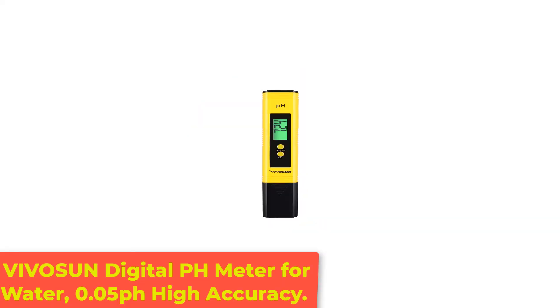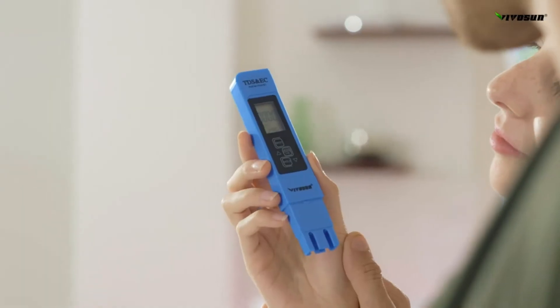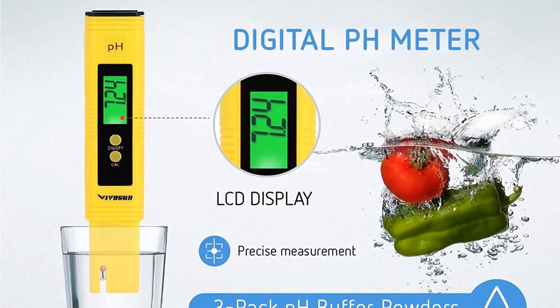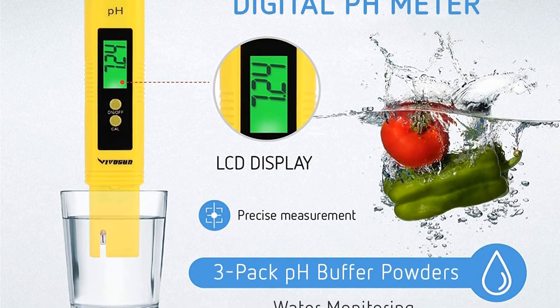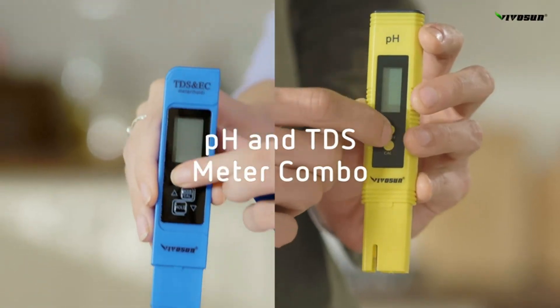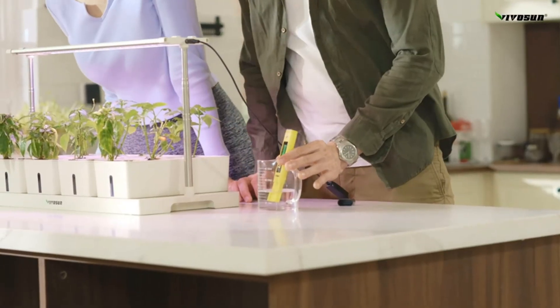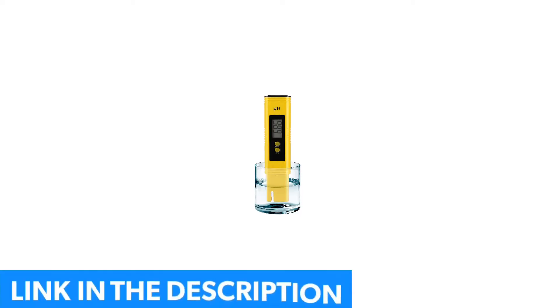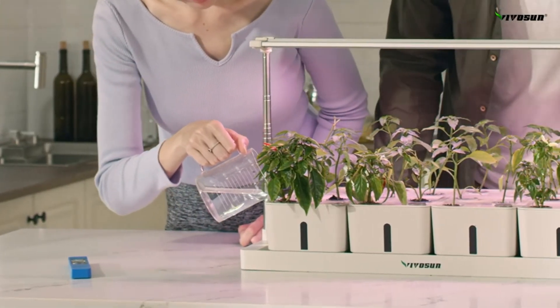Number 5: Vivicine Digital pH Meter for Water, 0.05 pH High Accuracy. The Vivicine Digital pH Meter stands out from the rest for its excellent quality and craft. This meter is good for use in pools, aquariums, hydroponics, and food and beer brewing. It's portable and very lightweight — you can easily put it into your bag or backpack. It comes with a case and a bright LED reading light, as well as a one-year warranty and money-back guarantee.